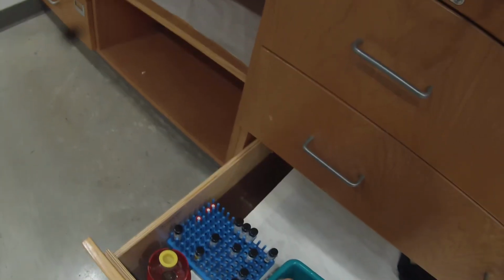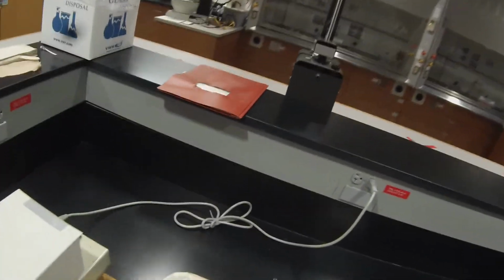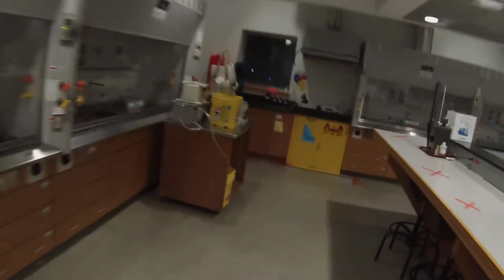So what I'm going to do, before I click the other button, is take this over to the lab. It just shows you how sensitive the GC mass spec instrument is, because that wasn't a very concentrated solution to begin with, but apparently way too concentrated for the GC mass spec, even at only 0.1 microliter. So we'll get some dichloromethane.